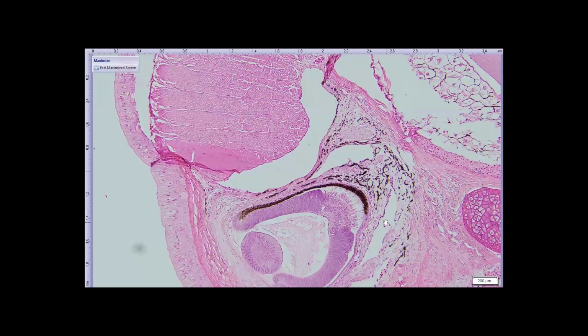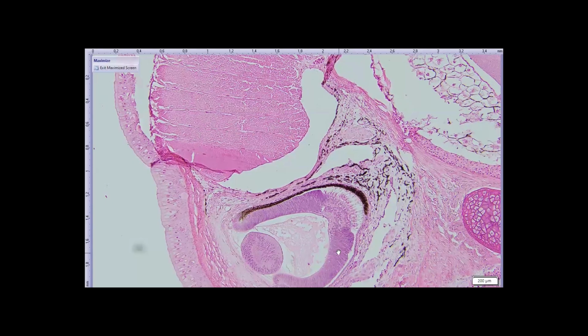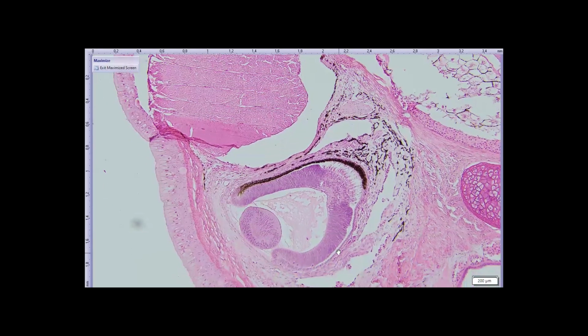Notice that there's pigmentation only over a segment of the choroid, and I believe this is retinal pigment epithelial pigment rather than choroidal pigment. So that's the eye of the embryo of the larval lamprey. And they're completely covered with skin at all depths? They're anatomically cryptophthalmic. Okay.